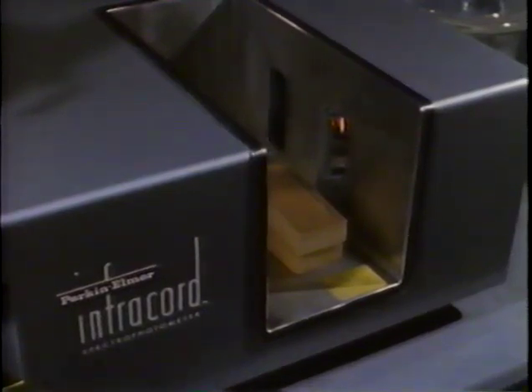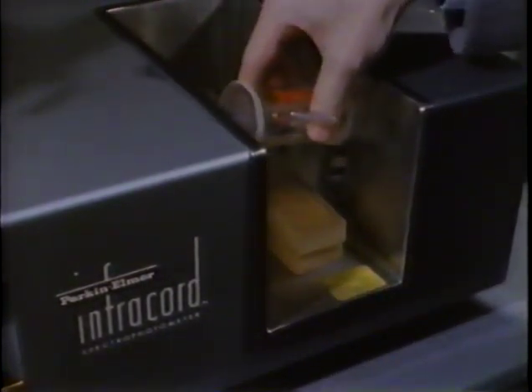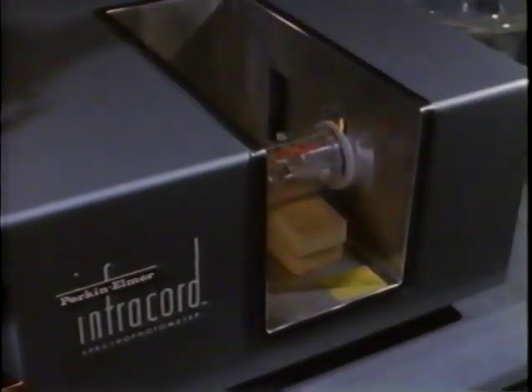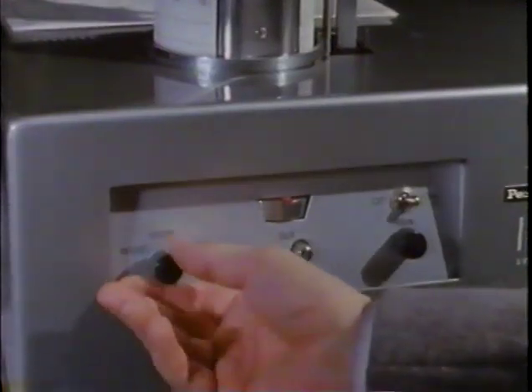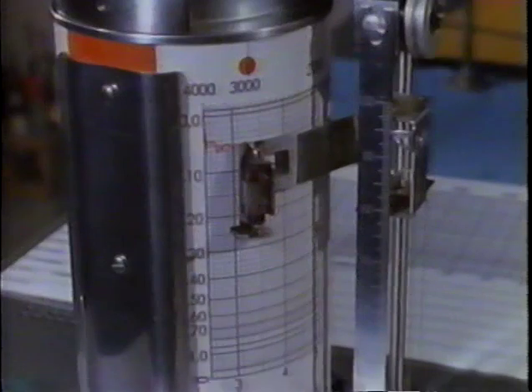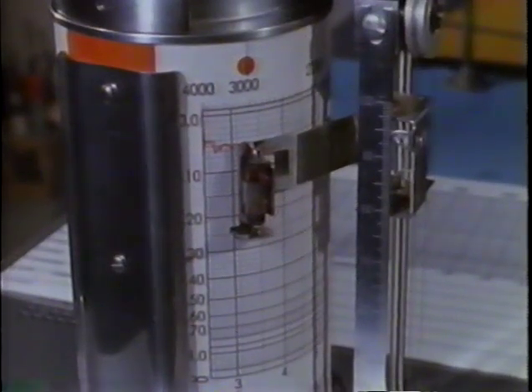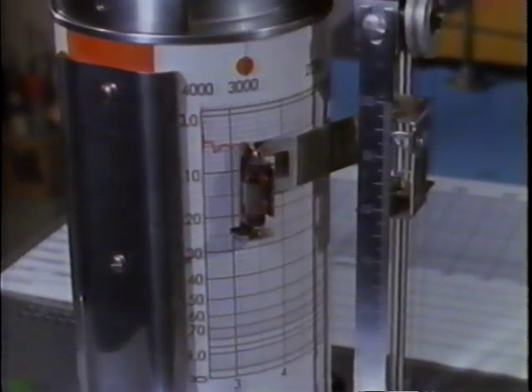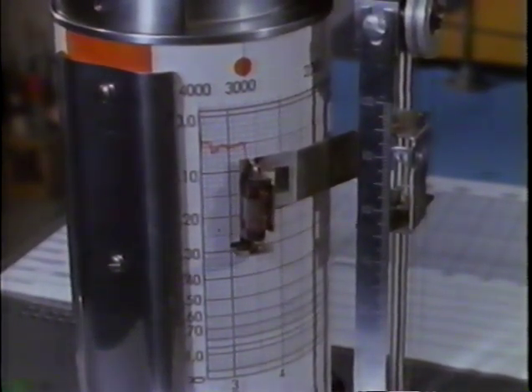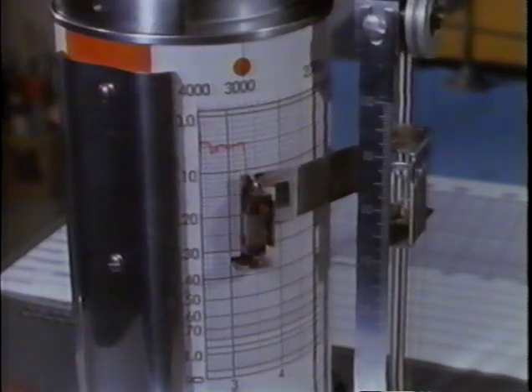For our first infrared sample, let's try a simple molecule, HCl in the gas phase. We start recording and scan to lower frequencies. The HCl sample is transparent at all frequencies until we get to 8.67 times 10^13 cycles per second, where the sample absorbs quite strongly.